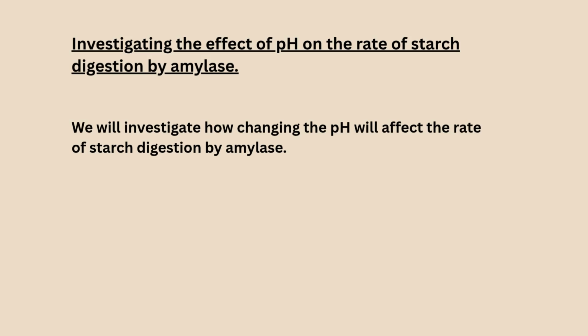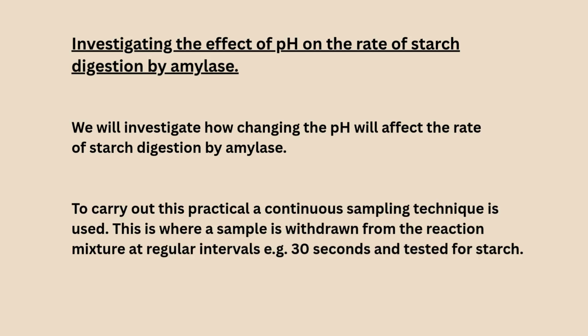We will investigate how changing the pH will affect the rate of starch digestion by amylase. To carry out this practical, a continuous sampling technique is used. This is where a sample is withdrawn from the reaction mixture at regular intervals, e.g. every 30 seconds, and then tested for starch.